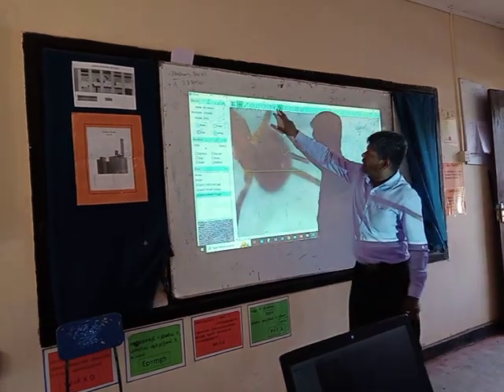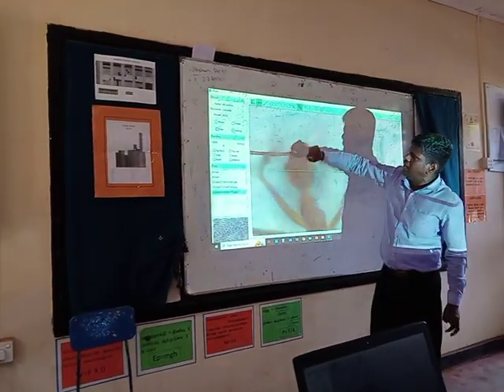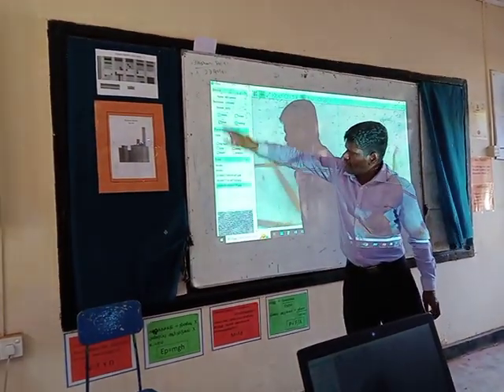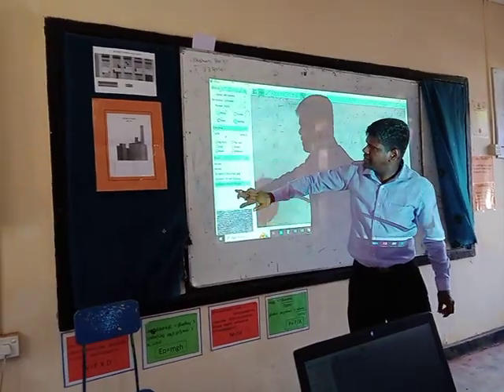So actually, we have a pen, we have a text tool. We can take images, we can scroll the files.